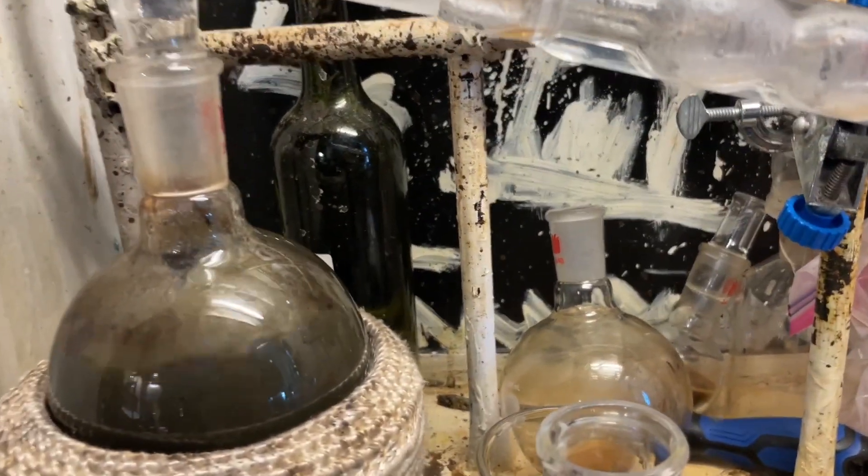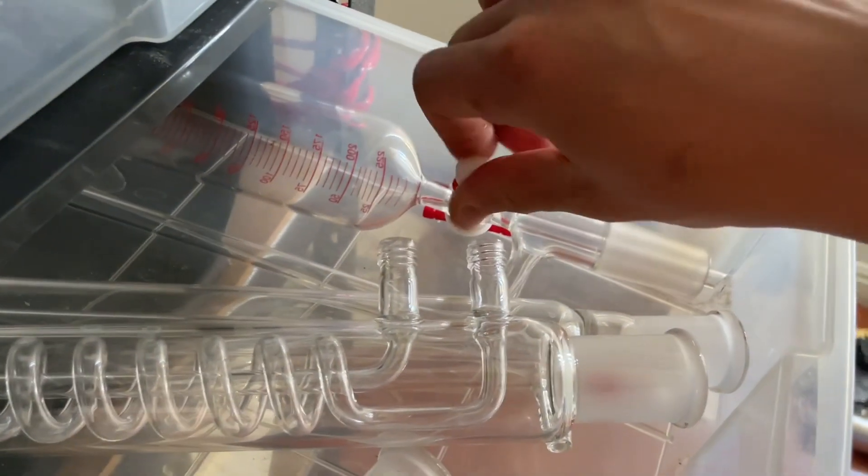Roughly. If I wanted to, I could just use my precision addition funnel. This thing has a needle valve so I can get a very precise drip rate.